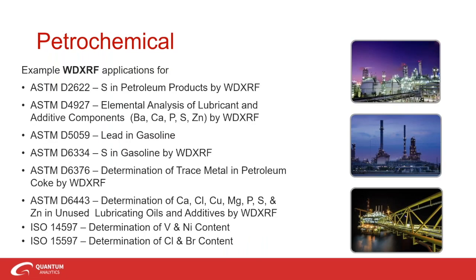Petrochemical. Now I know not everybody here is involved in petrochemical, I've seen some of the attendee lists. However, this is a good example of how an industry has really embraced this technology for several critical measurements to meet regulatory and quality demands for these types of products, such as the demand for analysis of sulfur in fuels and oils. This is increasing as environmental regulations worldwide continue to tighten.